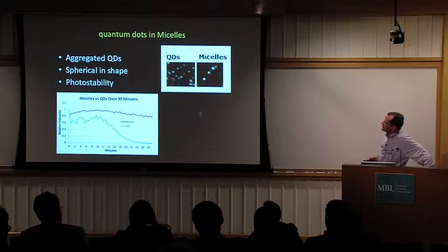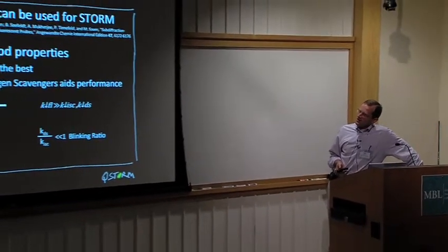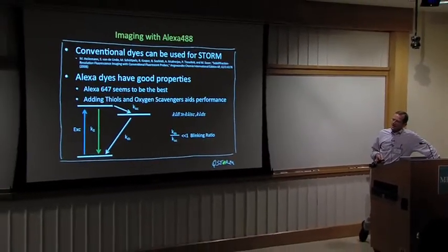Another technique, which Gang is going to talk more about, that has come out of this project, is to encapsulate the quantum dots in micelles to improve their stability. While Gang and Jessica are developing these photo-switchable quantum dots, we've also done some imaging using Alexa dyes.